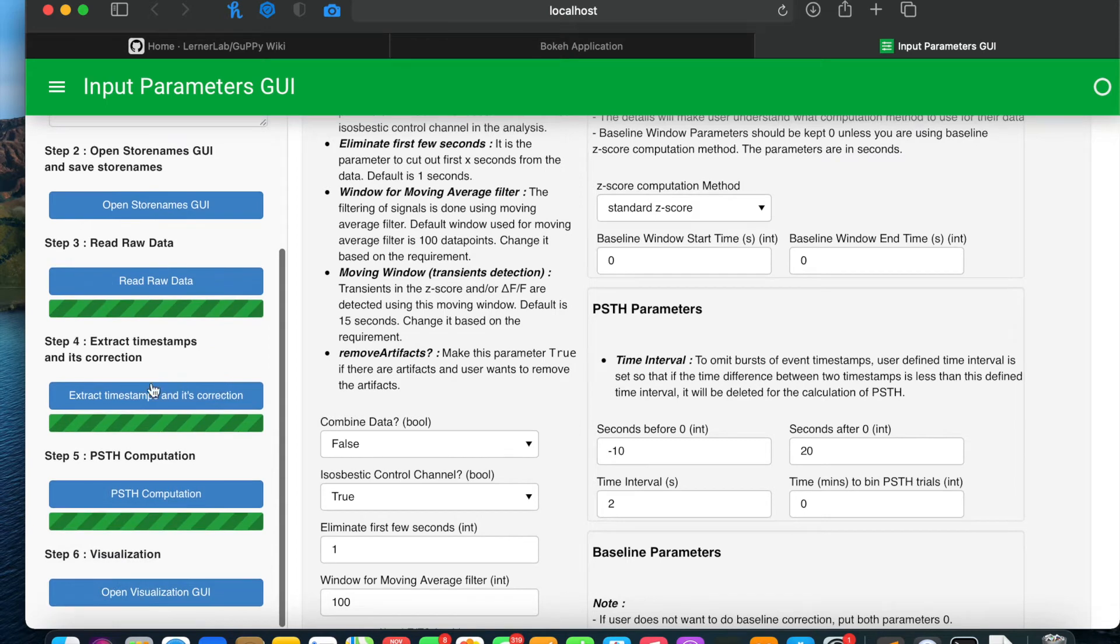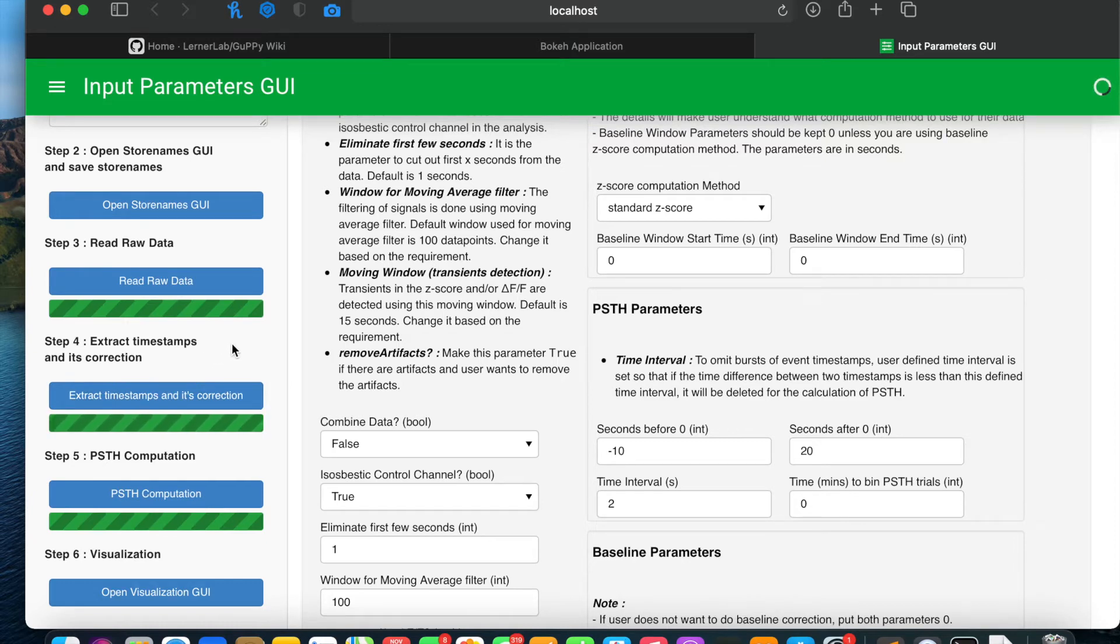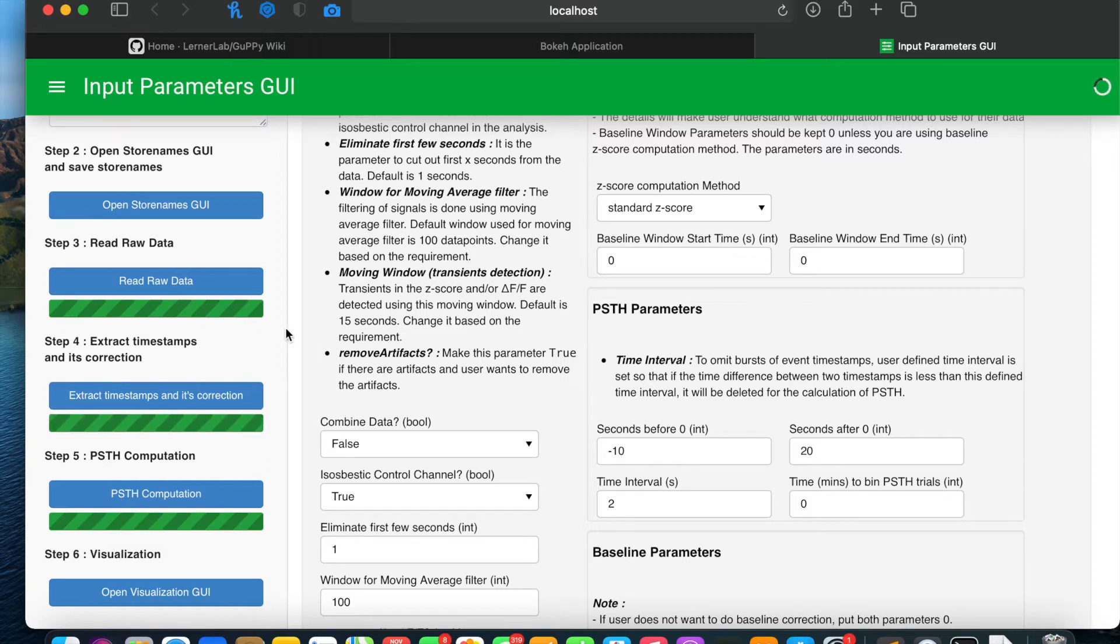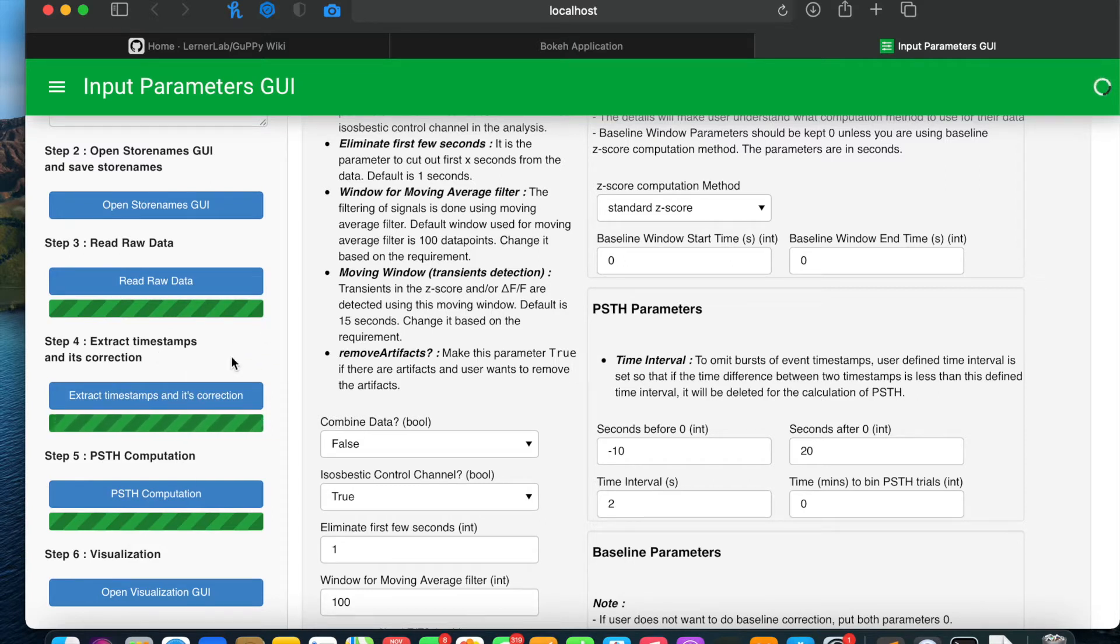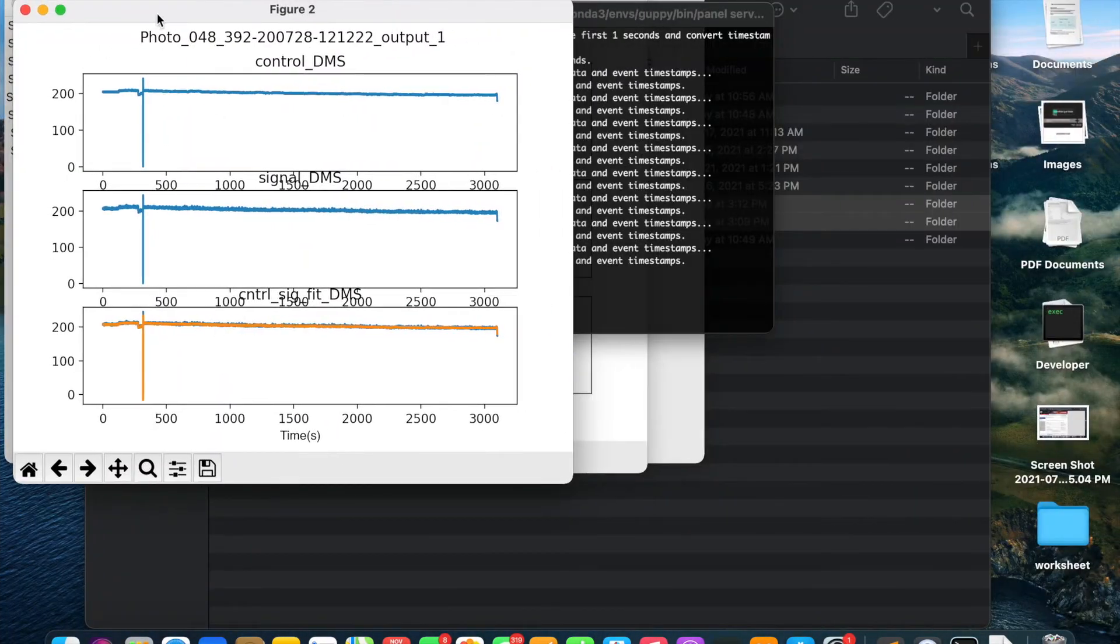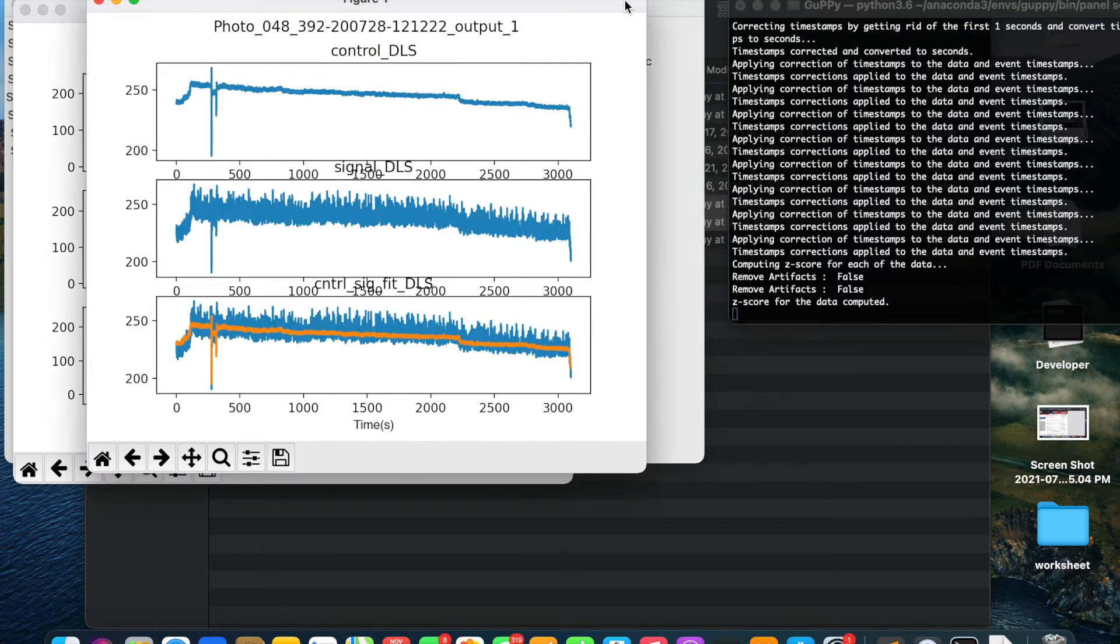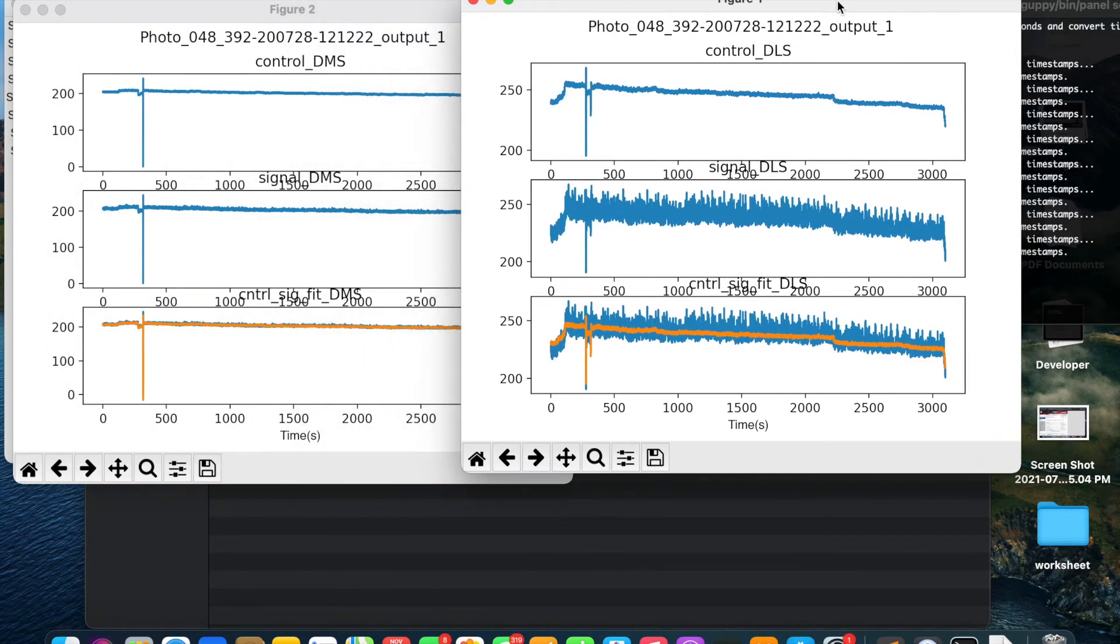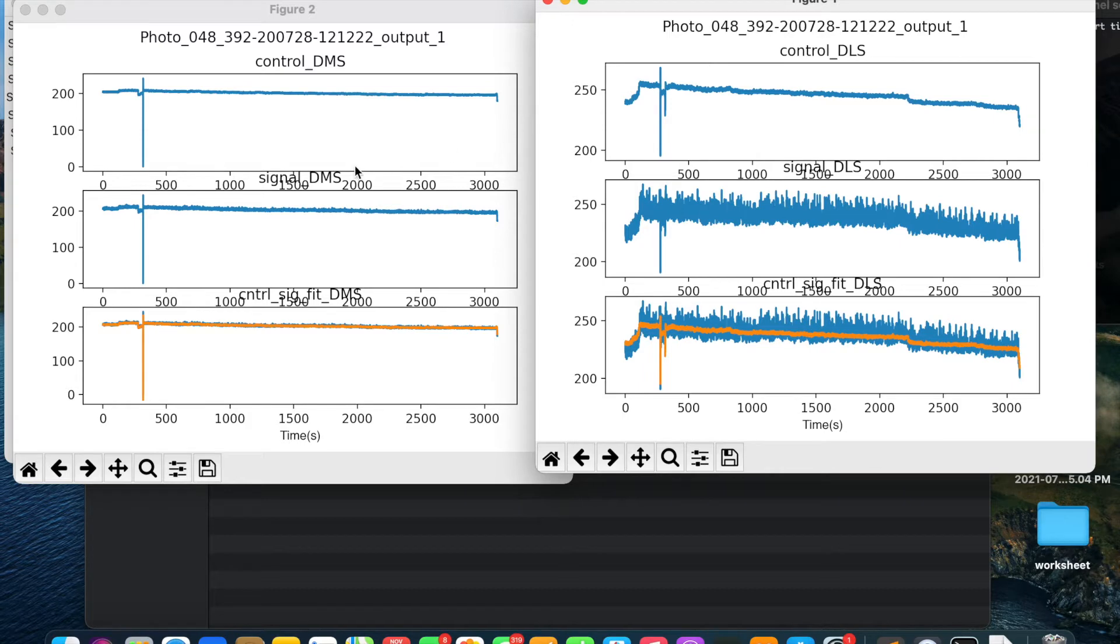Will move to the fourth step which is extract timestamps and its correction. After this step is completed, you will see plots of isosbestic control channel and signal channel. In my case, we will see two plots which will pop up after the completion of step 4. These are the plots which got popped up. Now in both the plots you see there is artifacts present.